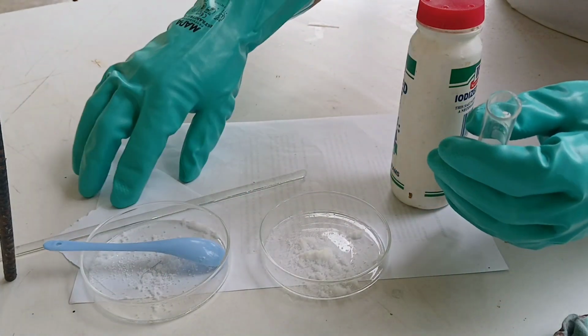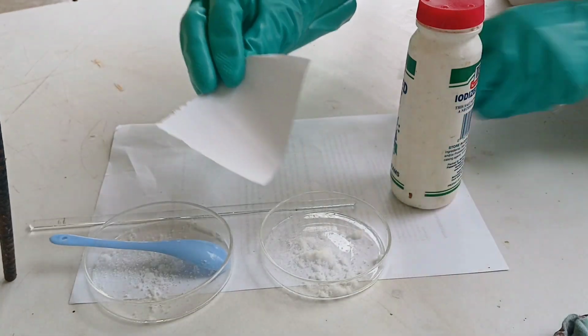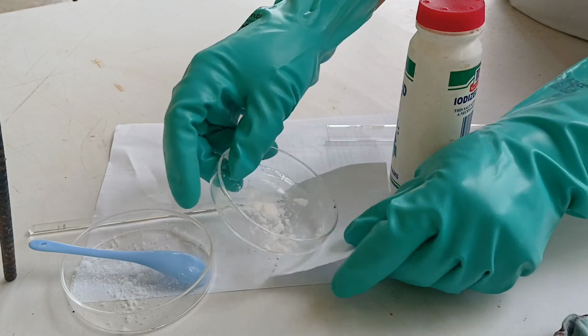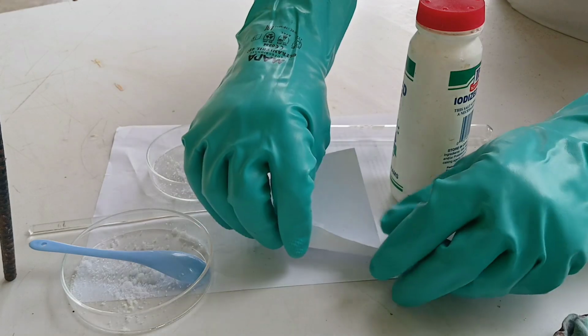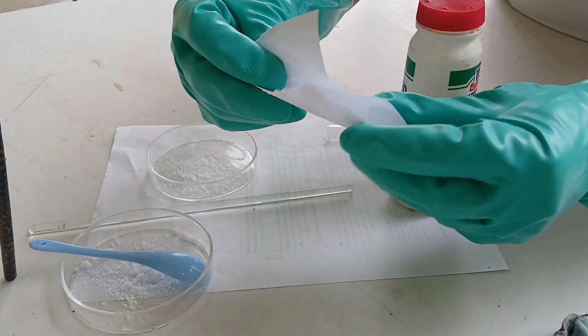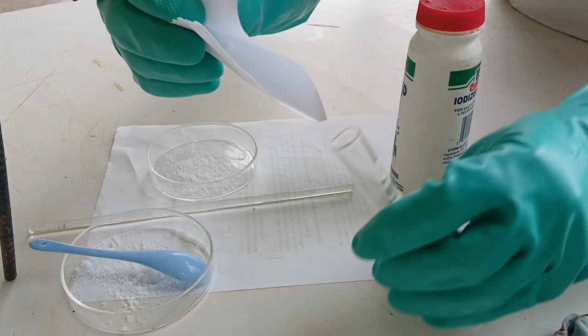To avoid splashes or spillage, you have to use paper, a very clean piece of paper as a pouring guide. Transfer the solid onto the paper, then tilt the paper with one end in the test tube to allow the solid to slide into the test tube smoothly.